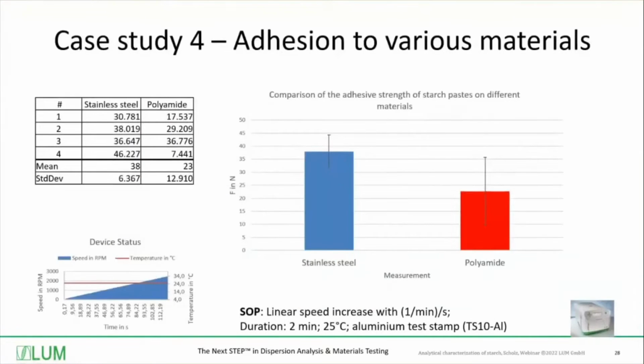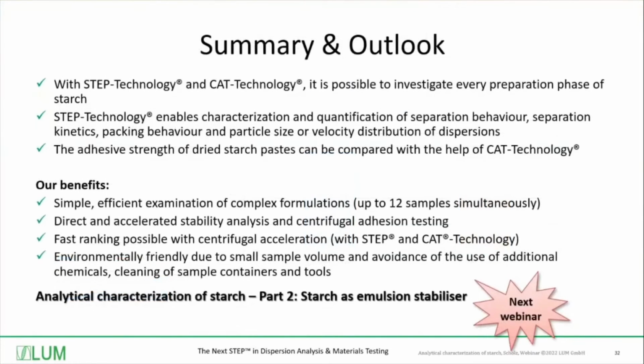Starch pastes achieve higher forces on steel than on polyamide, and the standard deviation for starch pastes on polyamide is larger. This webinar is the first part of a webinar series on starch. In the second part, I will talk about starch as an emulsion stabilizer.